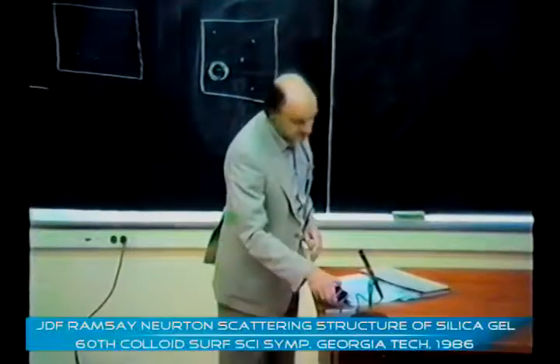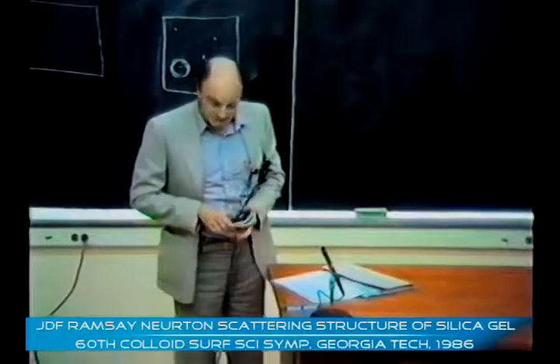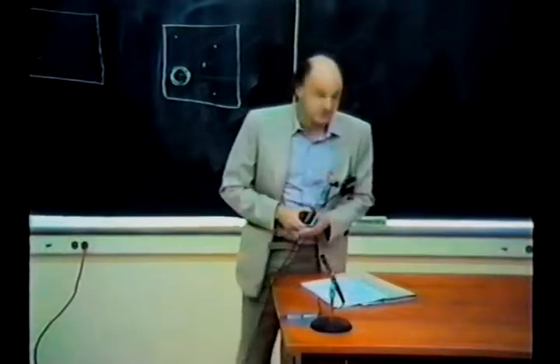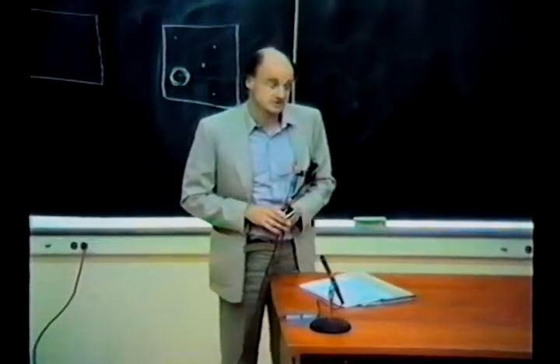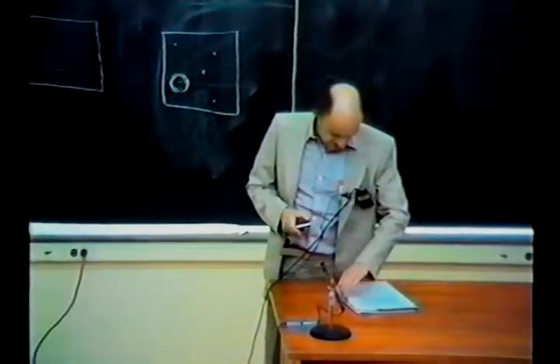In our paper, I'd like to describe how one can use neutron scattering to determine the structure of silica gels and also determine the properties of water in the pores within silica gels. So we'll be talking about the intermolecular structure of water and the dynamics of the water molecules.